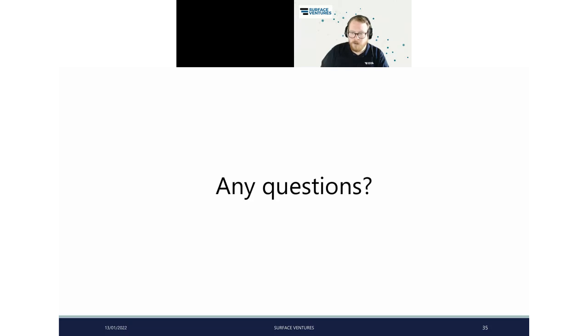Yeah. And also just to be aware, depending on the size of the analysis you're doing, you could apply other surface roughness or surface texturing analysis techniques, such as white light interferometry or simple, you know, larger scale stylus profilometry, depending on your surface. But AFM is always a good shout.